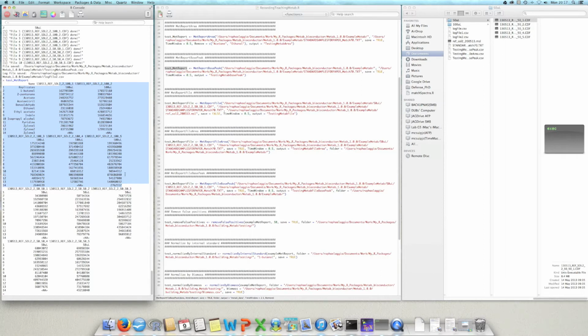So it's a bit low. And in this condition here it's even worse. It was found in only 1 of the samples. So I would say that probably this compound was a misidentification.